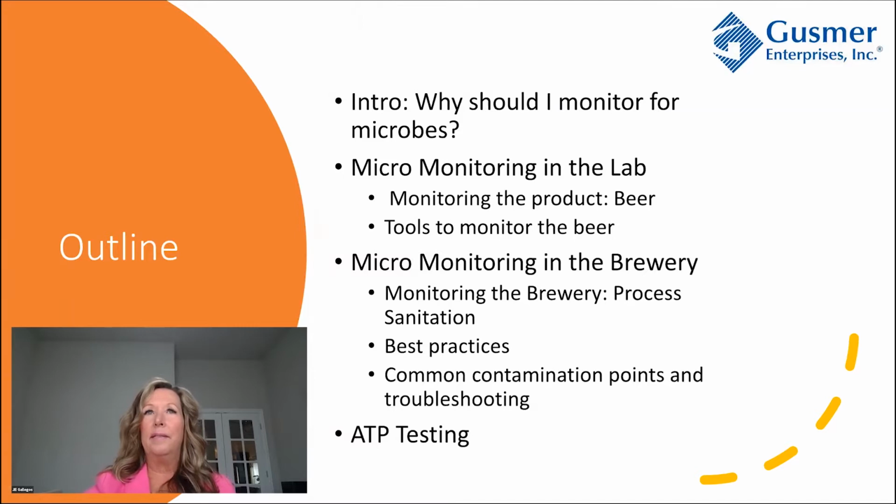So what we're going to talk about today, we are going to talk about why we should monitor for microbes at all. Then we're going to talk about some tools we have in the lab to use. And then we're going to go to some best practices and common contamination points and troubleshooting. And finally, we will talk about ATP testing.